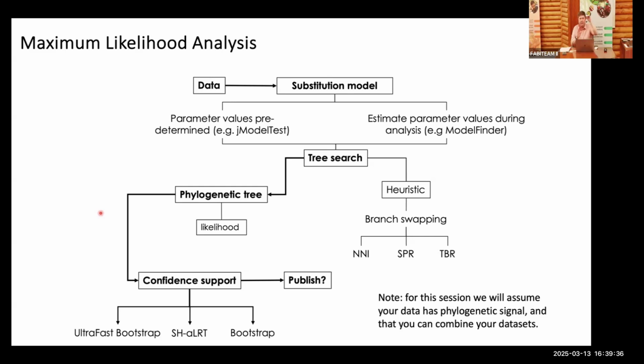So although you have a phylogeny, if there's no statistical support, you do not have confidence in how these taxa are related. And there are different ways in maximum likelihood, and specifically IQ-TREE. We can do an ultrafast bootstrap analysis, and I will talk a little bit about it, supported by Shimodaira-Hasegawa.